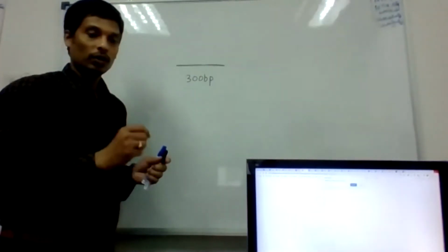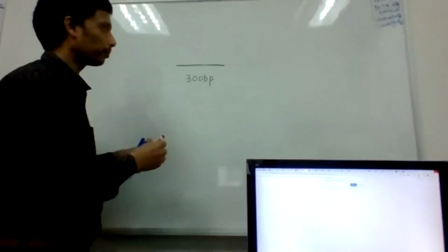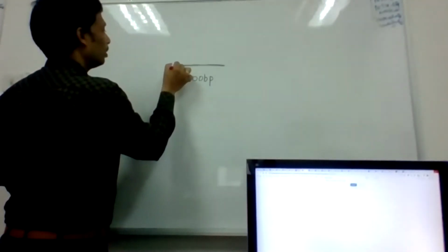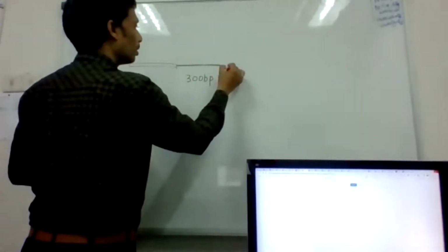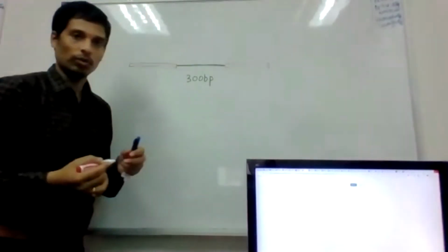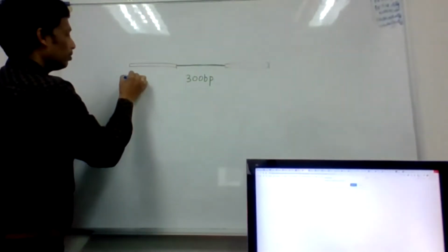After that, you are going to add some adapters at the 5' and the 3'. These adapters are nothing but a DNA sequence.